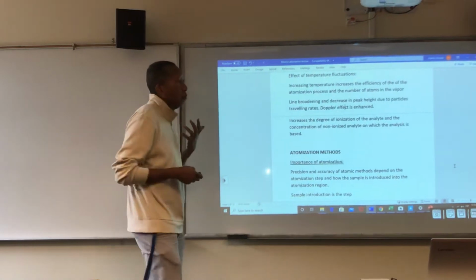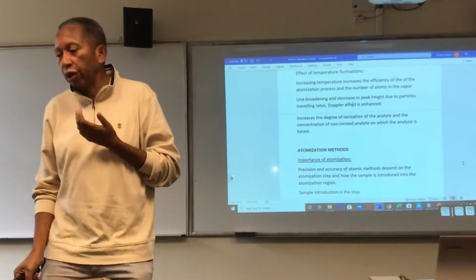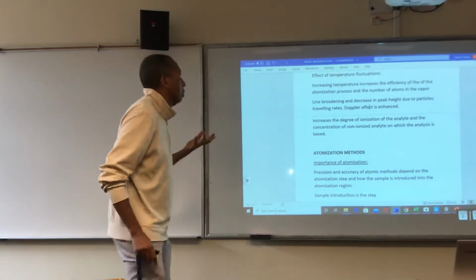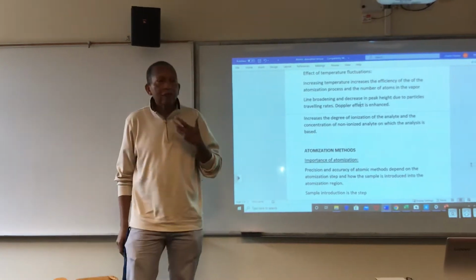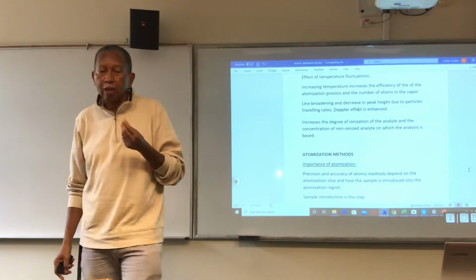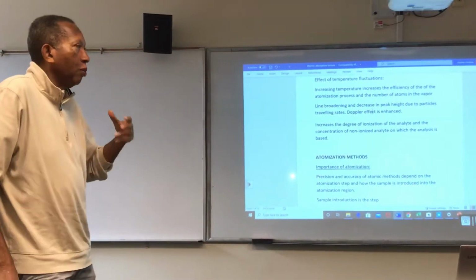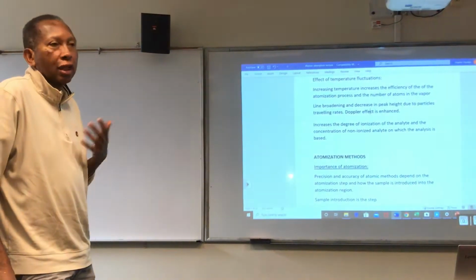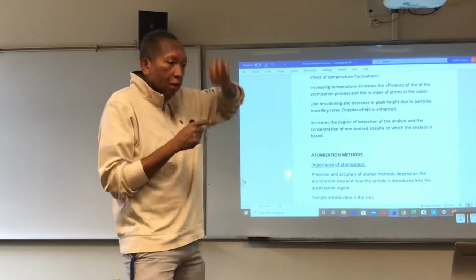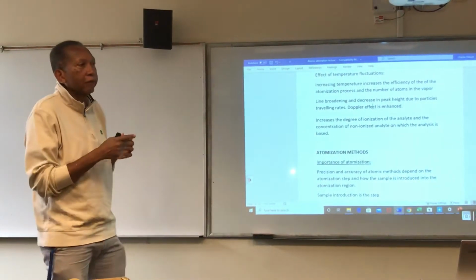Also remember, we spoke a little bit about the Doppler effect, and the Doppler effect is really very important and very exciting, because as far as you're concerned now, whenever you make a measurement, you have confidence in the measurement, right? Because the instrument that you are using to make the measurement doesn't impact what the output is. So if you put a thermometer in a jar with ice water, you get a reading, and that's fine.